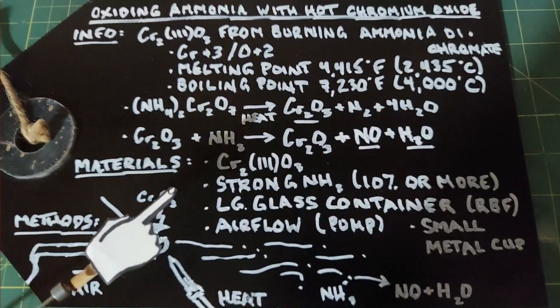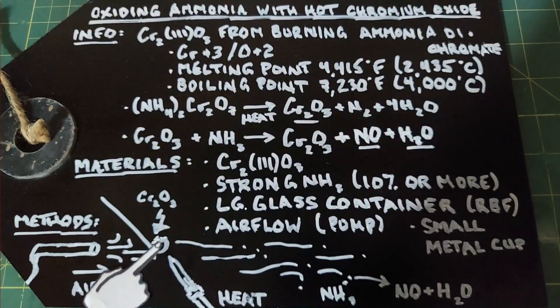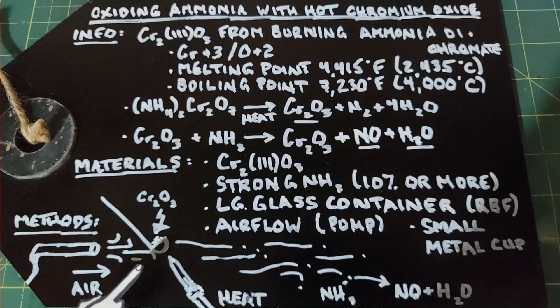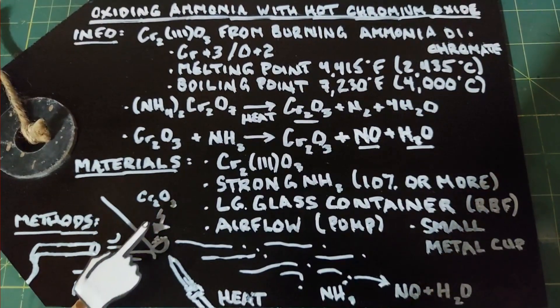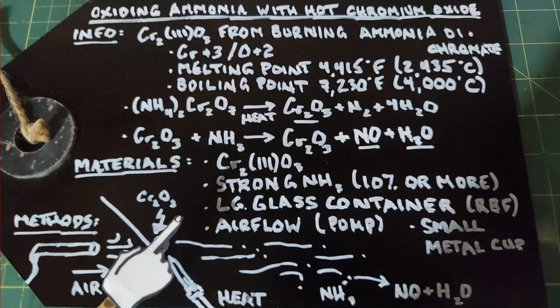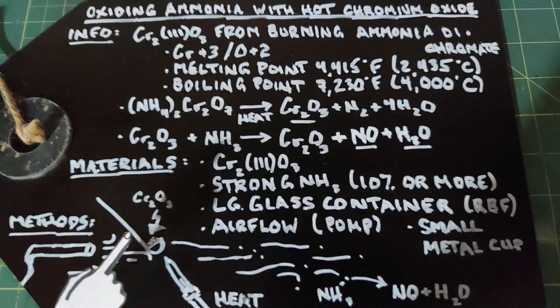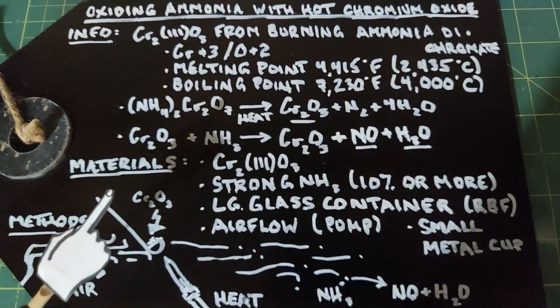The reaction itself is pretty simple. The setup is not necessarily. The idea here is to heat the chromium oxide in a small metal cup while it's in an environment of ammonia gas. That usually comes by heating the ammonia with an airflow that can blow this hot chromium oxide into the ammonia environment, and therefore we get the reaction to occur. I have a setup that I think will work and will be successful, so let's get to it.